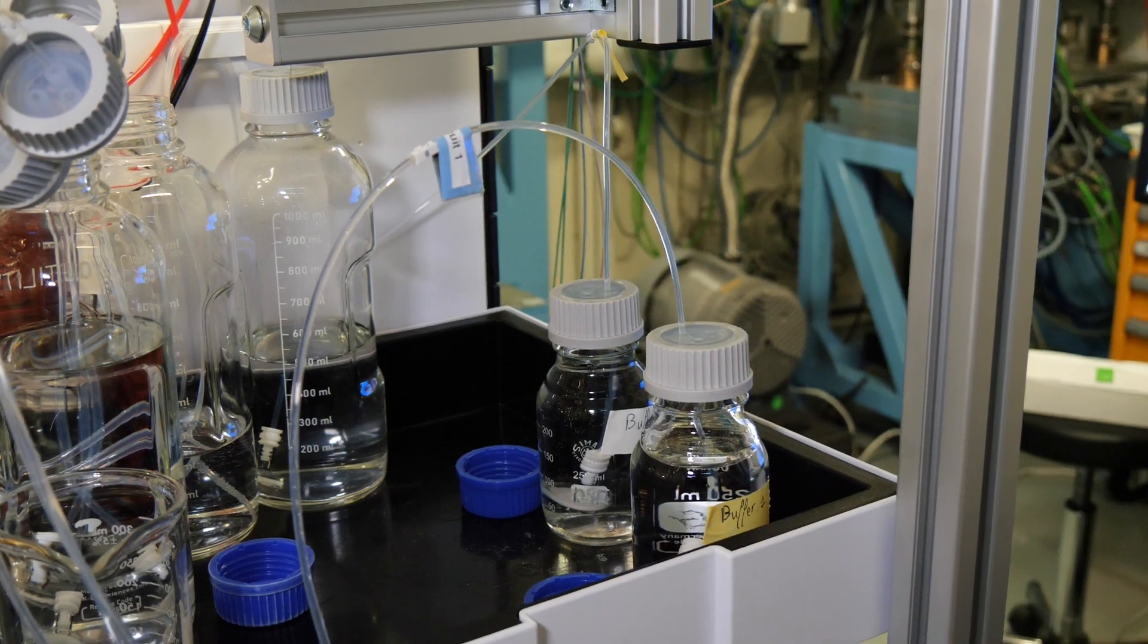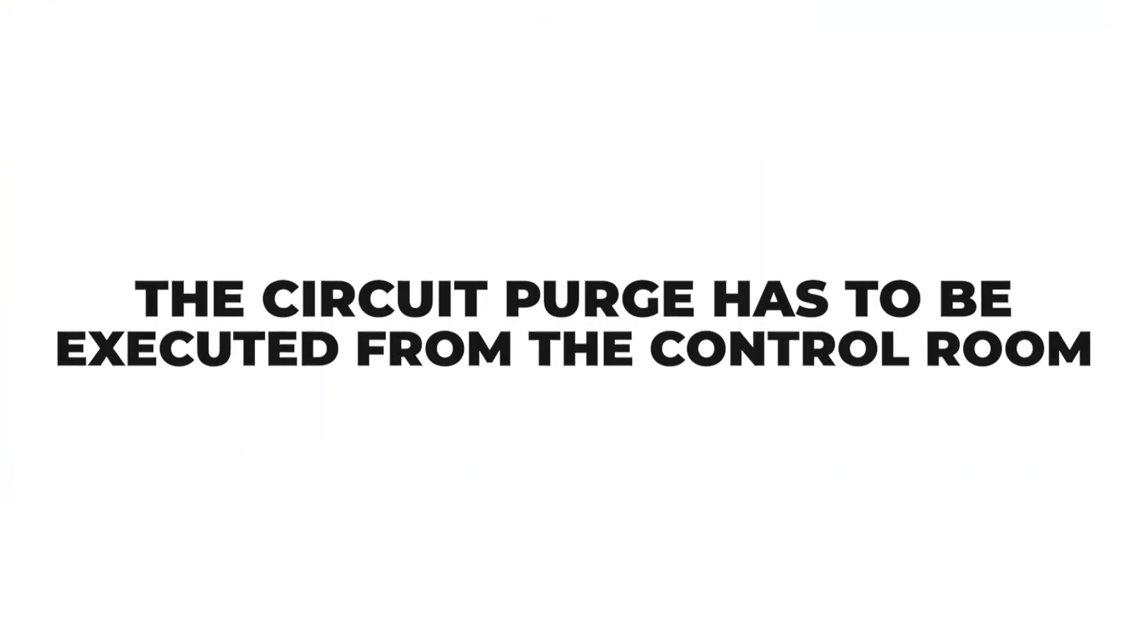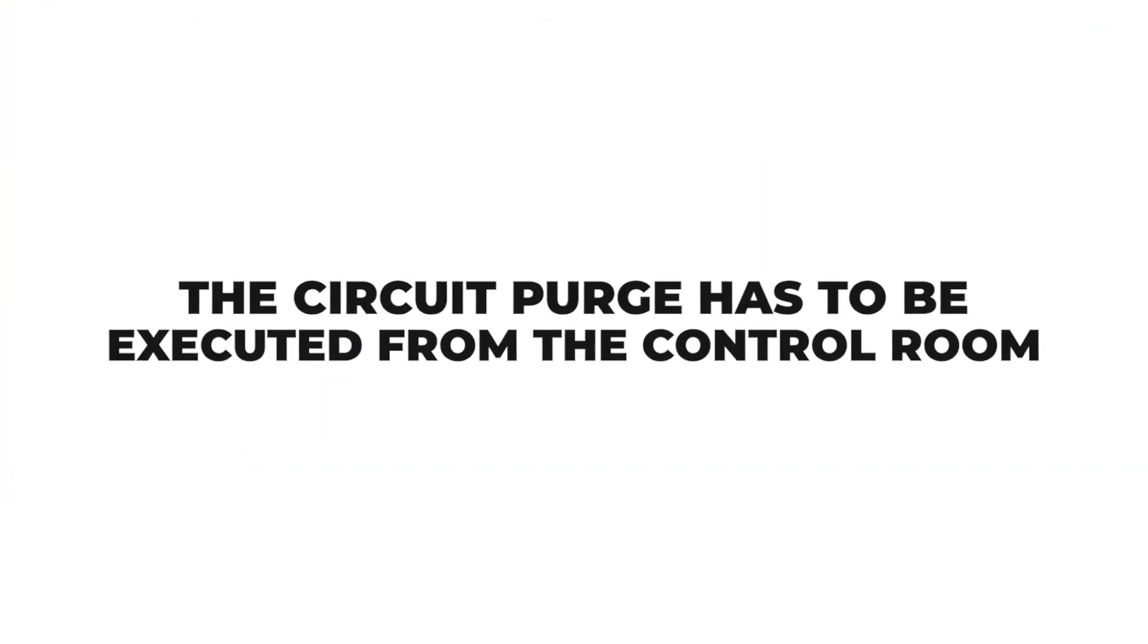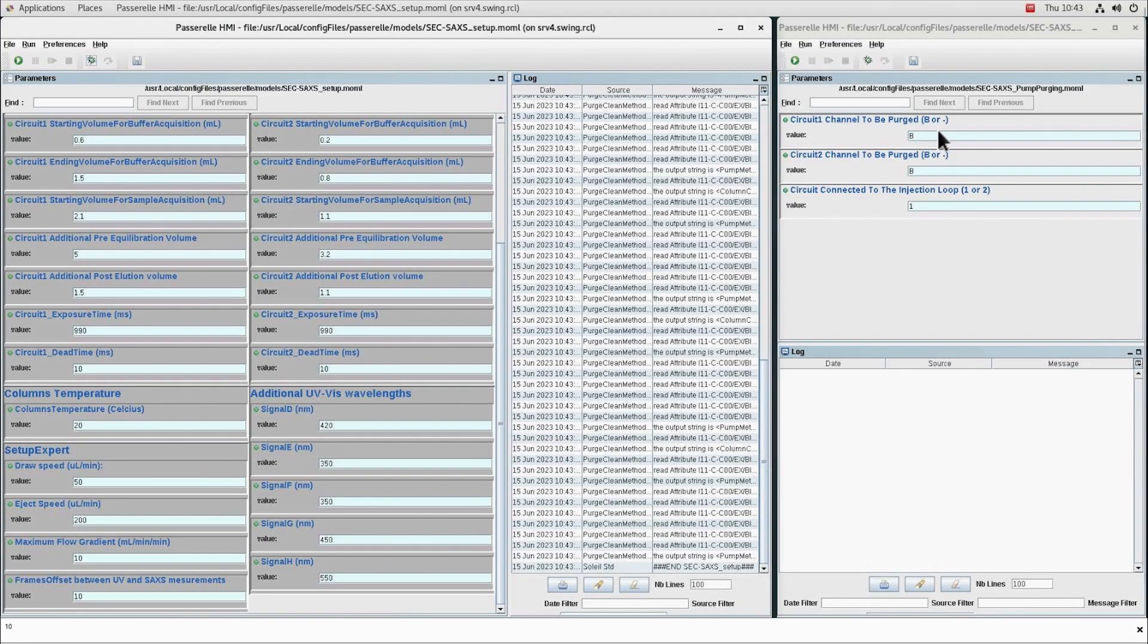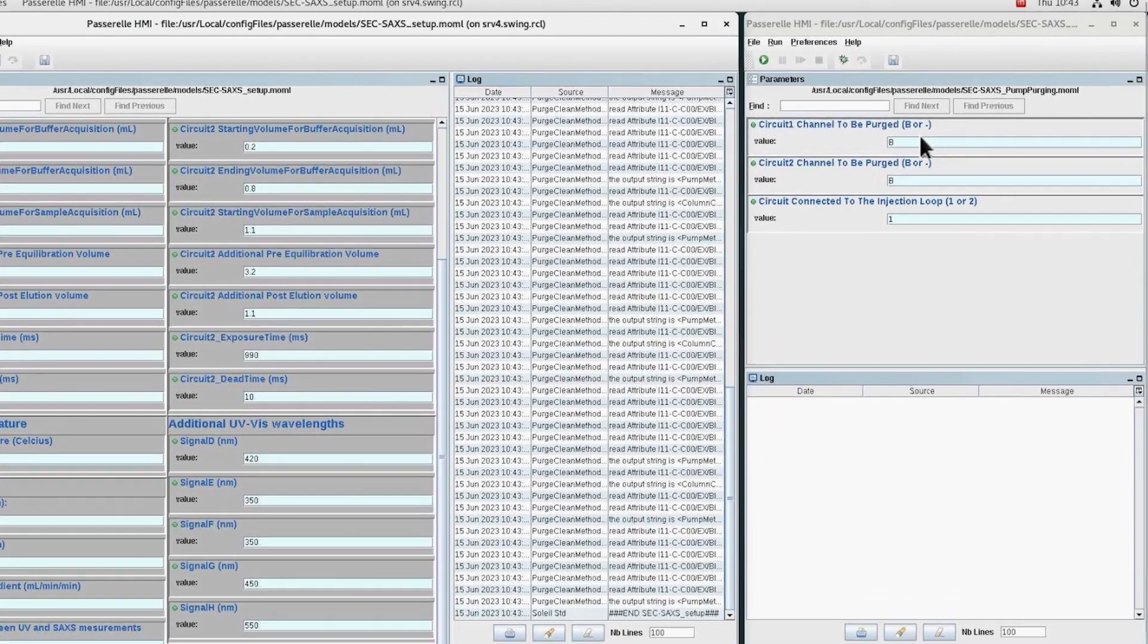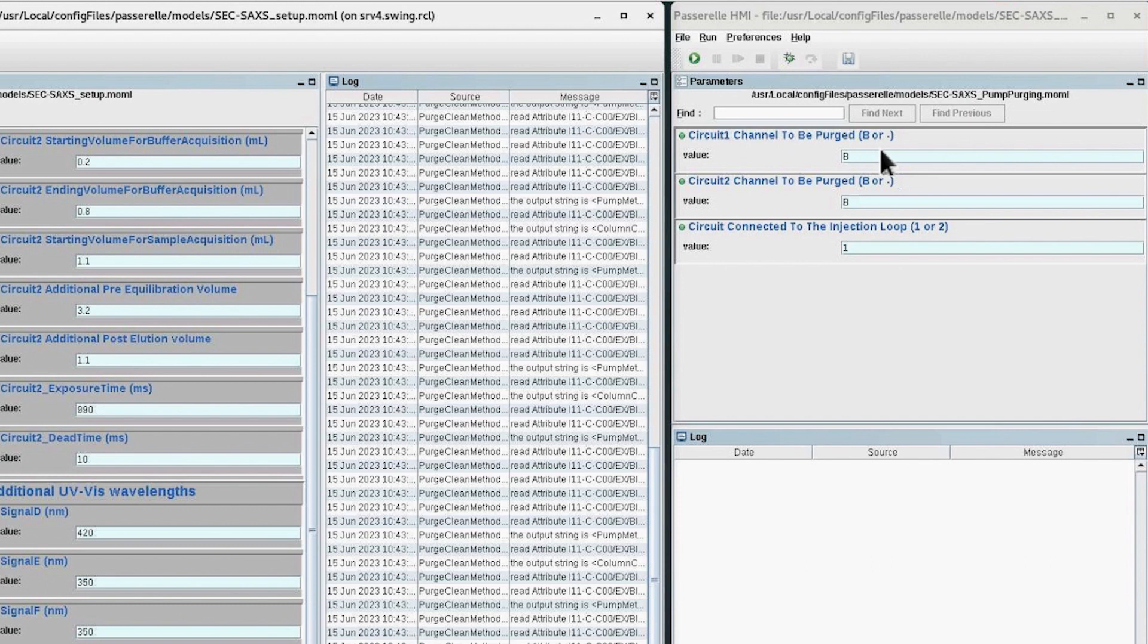When this is done, the circuit purge has to be executed from the control room. On the SEC-SAXS setup screen, the purge HPLC pump parameters need to be filled. If a circuit needs to be purged, the circuit to be purged parameter has to be B1.